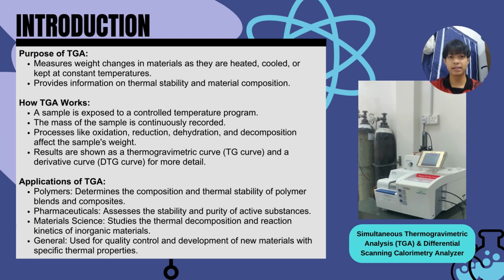So TGA has a wide range of applications across different industries. In the polymer industry, TGA helps determine the composition and thermal stability of polymer blends and composites.